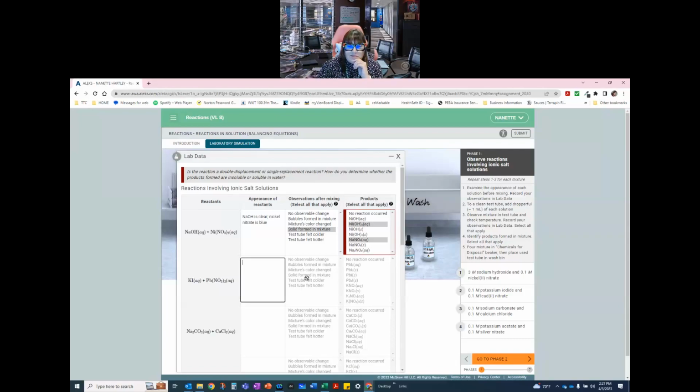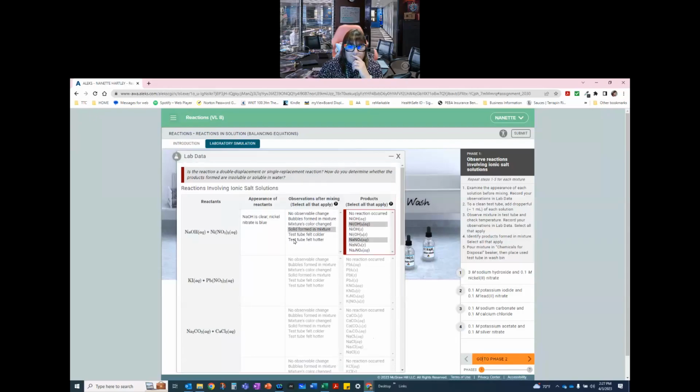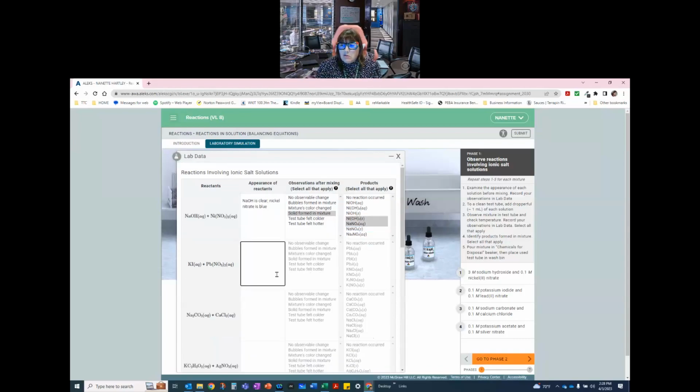That better be right. Oh, sorry, not aqueous. There we go, that one. I picked the wrong one. No, pick the one that was solid, not aqueous. So that's what you're going to be doing for this. The way that you should handle this is to write this down on paper. NaOH plus Ni(NO3)2, and what that gives you.